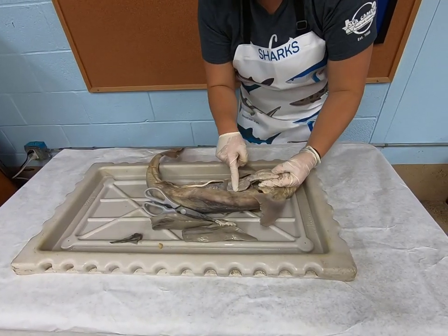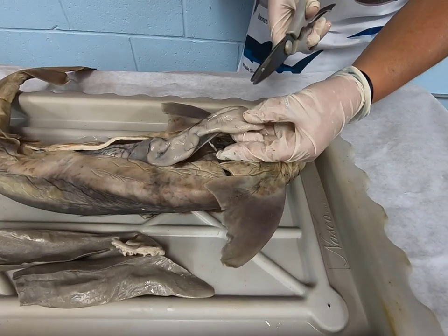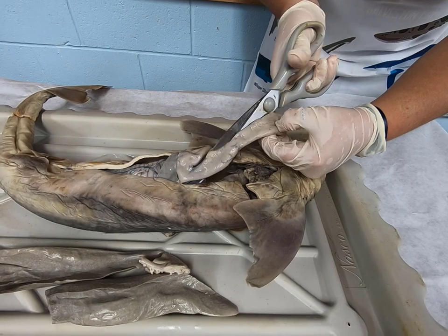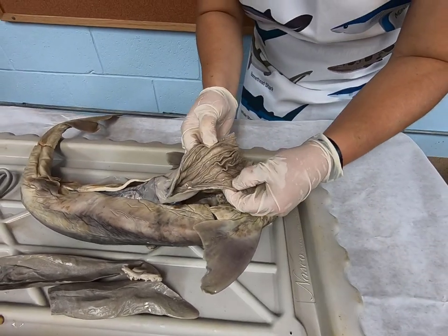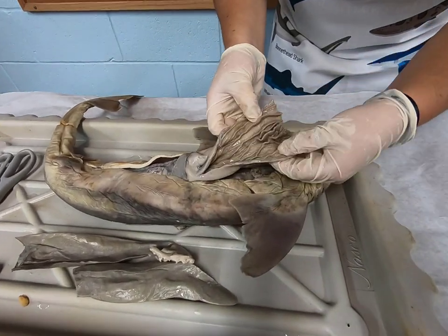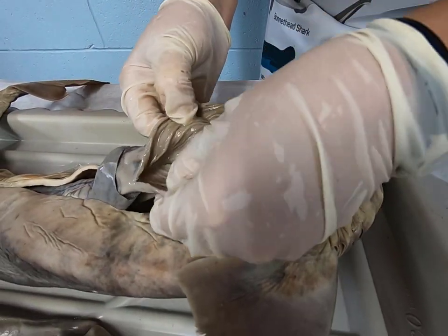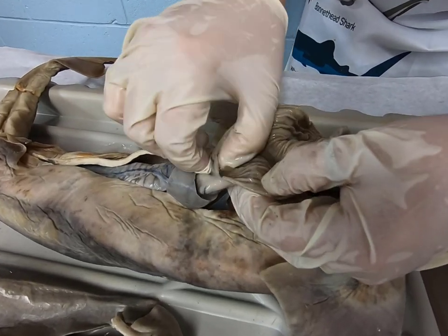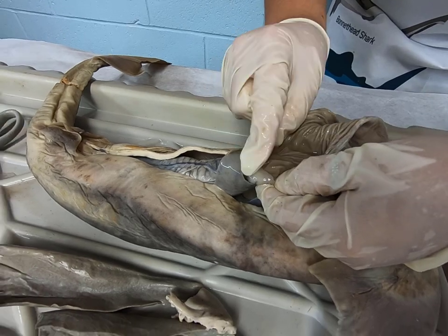So this organ right here is actually their stomach. And their stomach has these folds in it called rugae. Everyone say rugae. Now, rugae are these folds that allow the shark to be able to expand their stomach. So we actually can see those folds are pretty tight in here, and they loosen up a little bit down here. So with all these gastric juices that we're seeing, it must have just digested something not too long ago. But these are kind of expanded a little bit.